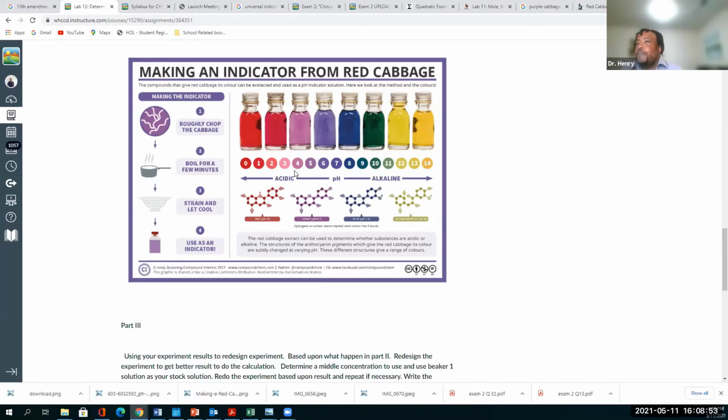Okay, get a conical tube, put a little bit of vinegar in there, and then pour a little bit of your cabbage juice into that vinegar. All right, I can do that. And then after you do that, rinse it out again and get a little bit of baking soda in there. Baking soda, vinegar. Is there anything you can think of that you want to figure out the pH of? We use the cabbage. All right, here we go. This is vinegar. Let me record my data real quick.